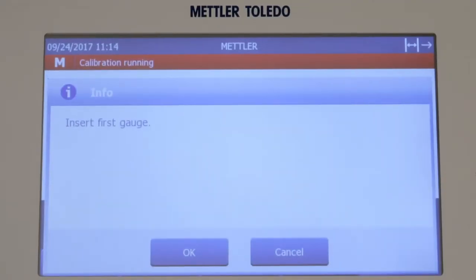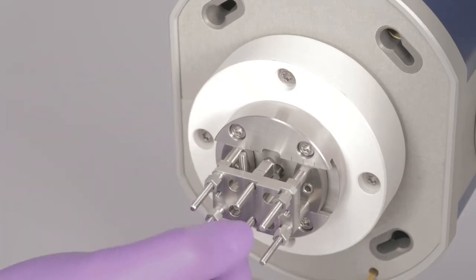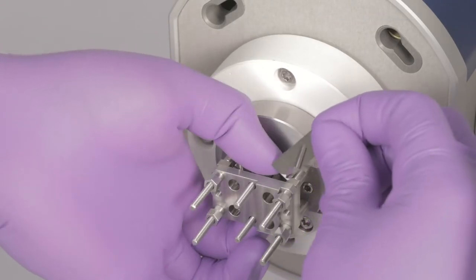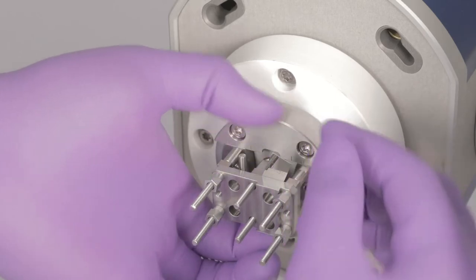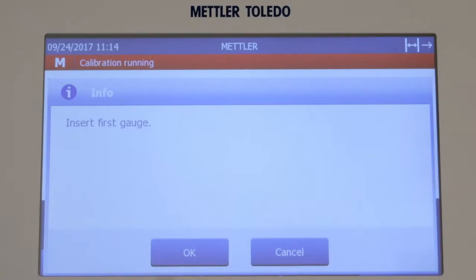The message Insert First Gauge appears. Remove the two nuts in the middle drive shaft clamp. Gently push the middle support pillars far enough to allow the gauge to fit in the gap and insert the 0.3 mm gauge underneath the alignment insert. Tap OK.